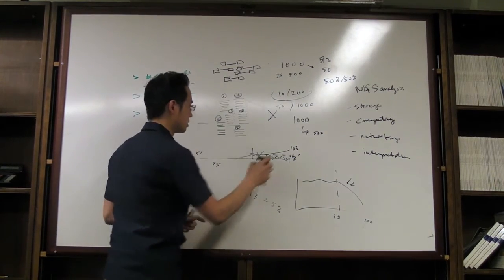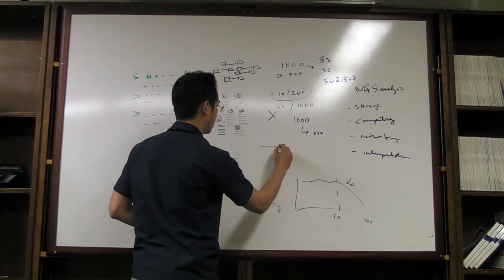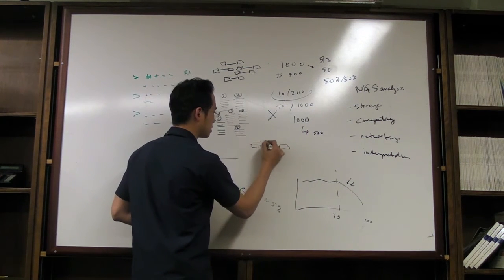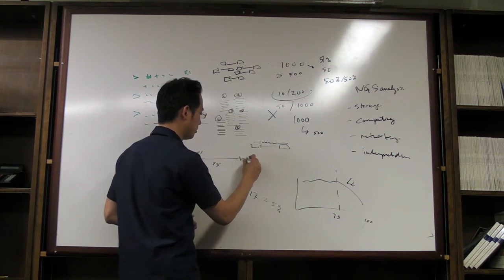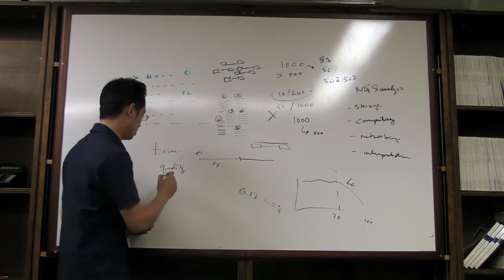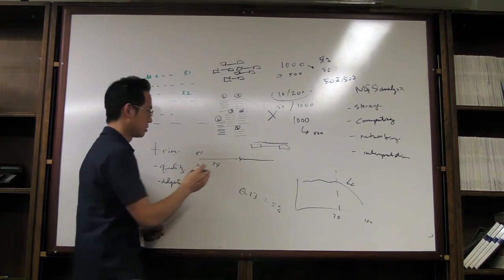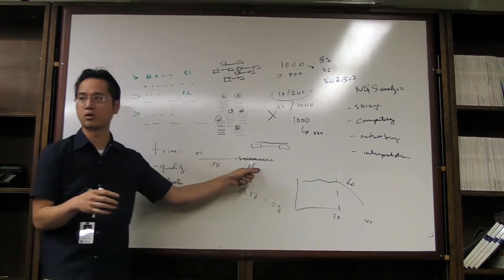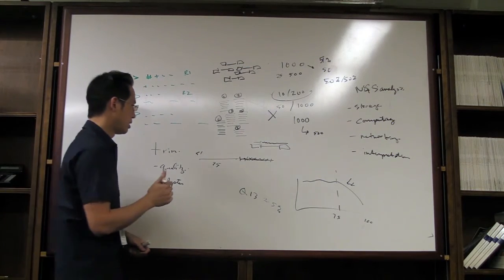Sometimes when you sequence, let's say this fragment is a little bit smaller than what you anticipated. You started sequencing on this side. Whoops, you read into the adapter. So you're going to have a little piece of adapter there. So you can do adapter trimming as well. Cut this away. It's an adapter. It's not part of what I'm trying to test or analyze. So just trash it for me.